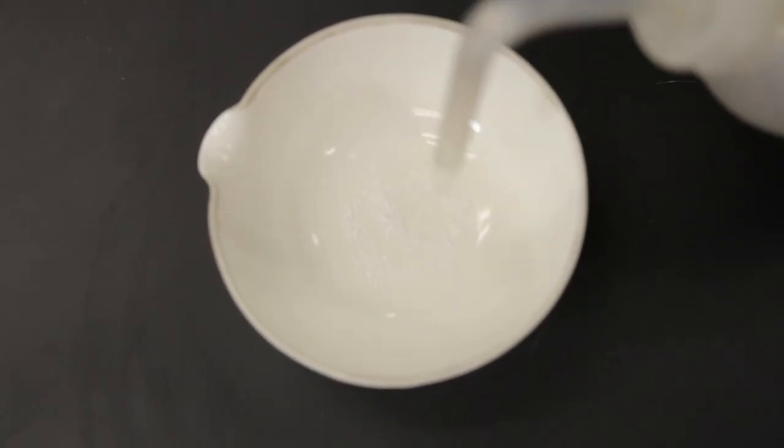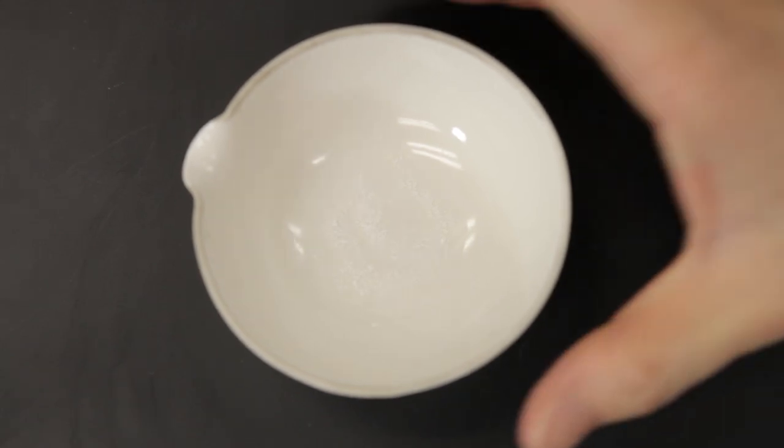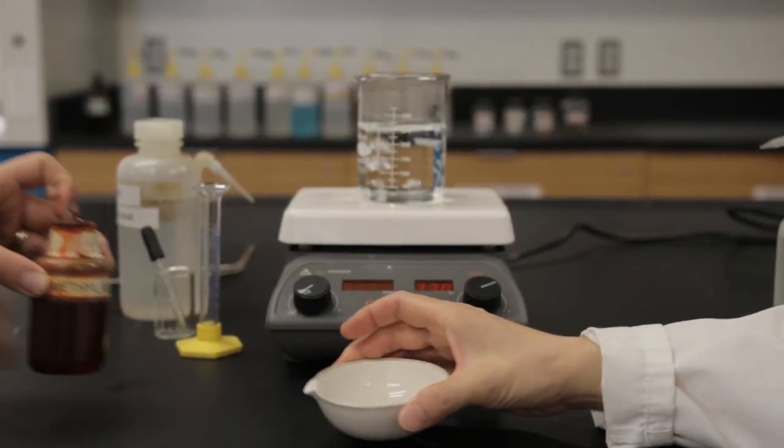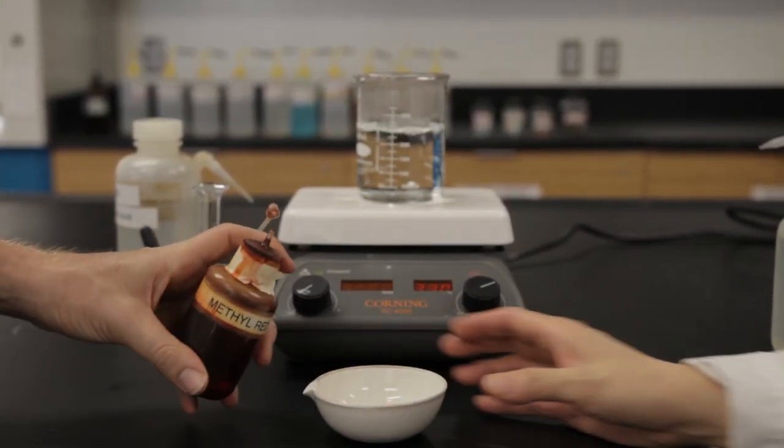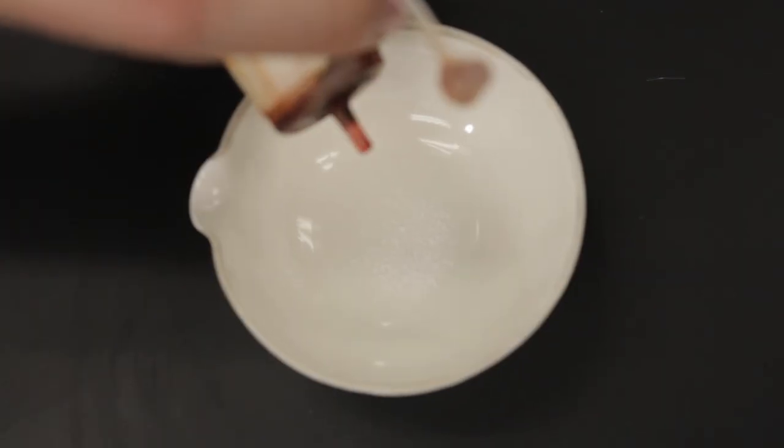Add distilled water dropwise to the sodium carbonate just until the salt is moistened. Then add four drops of the methyl red indicator. The solution will turn yellow.